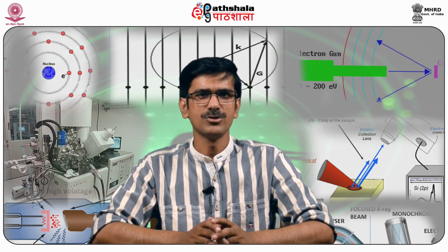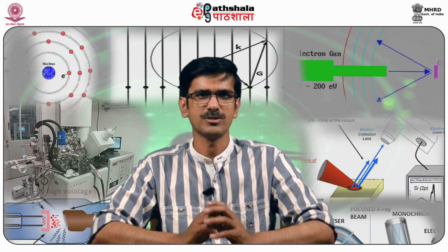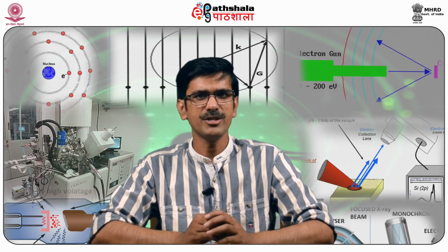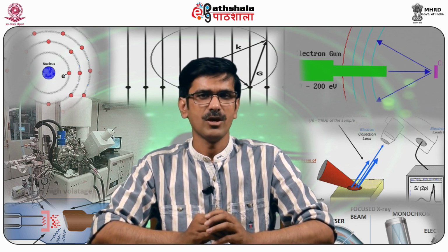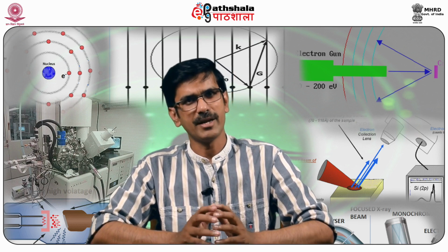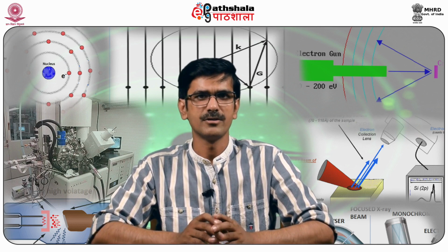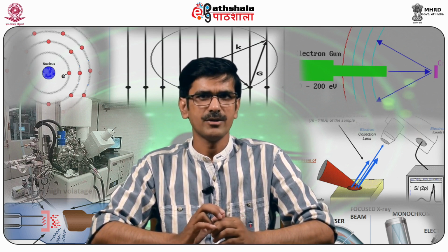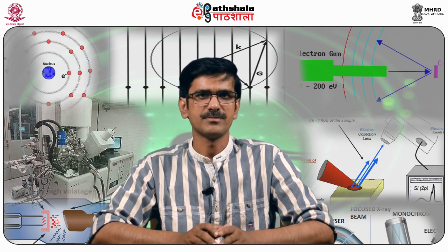It is interesting to know the process through which this is possible. What are all the instruments that deal with it? What are the components of the EDAX instrument? How does each component function? What type of materials can be analyzed? And many more questions must be coming to your mind. To answer all these questions, we will cover them in the upcoming slides.